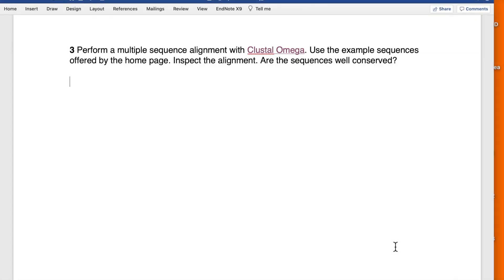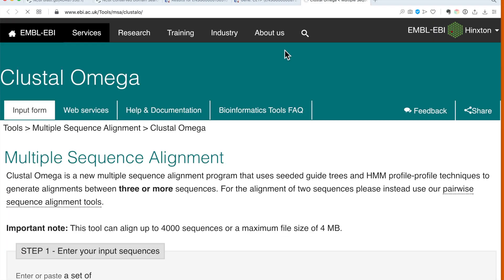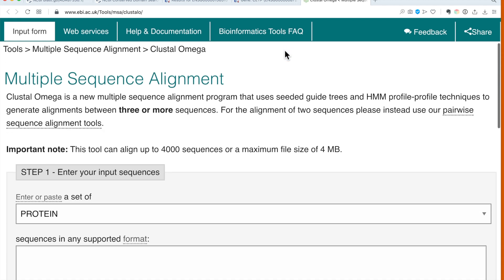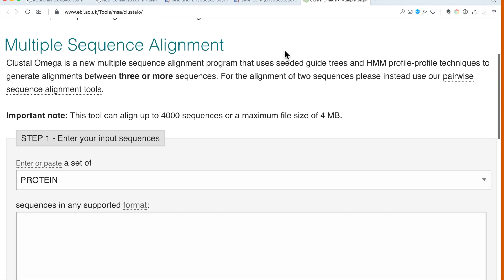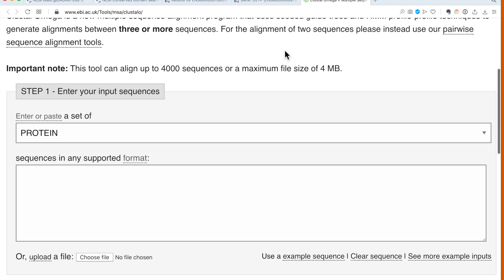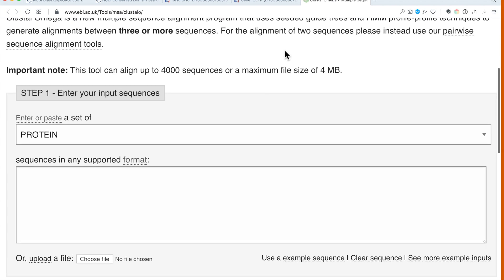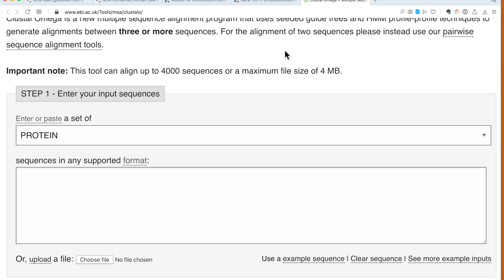Exercise three: Perform a multiple sequence alignment with Clustal Omega. Use the example sequences offered by the home page. Inspect the alignment. Are the sequences well conserved? It's a natural question for multiple sequence alignment. Let's click on that page and get a new browser window. Clustal Omega is correct.